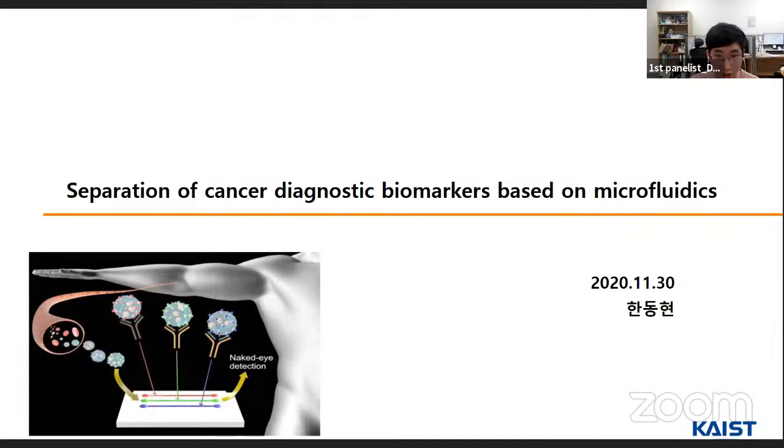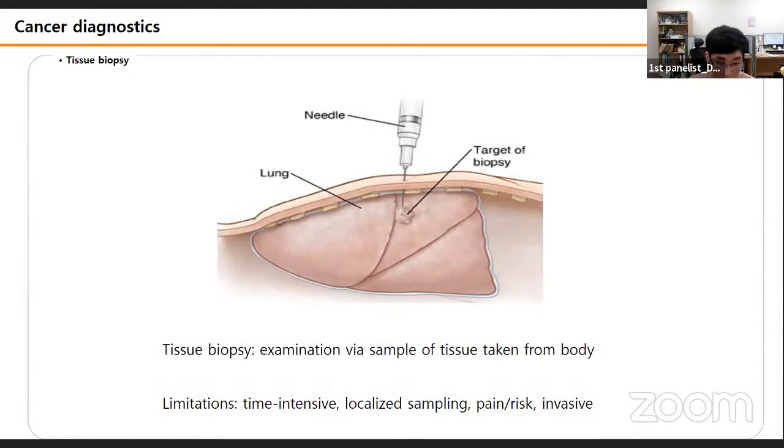Hello everyone, this is Han Donghyun, and I'll present separation of cancer diagnostic biomarkers based on microfluidics. Before delving into the separation of cancer diagnostic biomarkers, I will briefly demonstrate the overall concept of cancer diagnostics based on microfluidics. As previously mentioned, cancer is one of the major issues the human race is still struggling with. Appropriate and accurate cancer diagnostics is crucial to improve overall health, welfare, and human life.